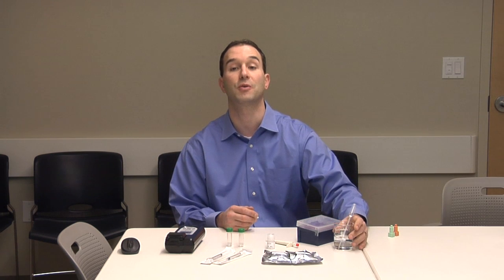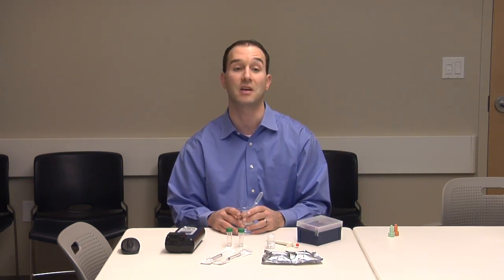First, let's take our sample. For best results, use a freshly collected sample and use it within 1 to 2 hours of collection. And remember to use a clean container to prevent contamination.